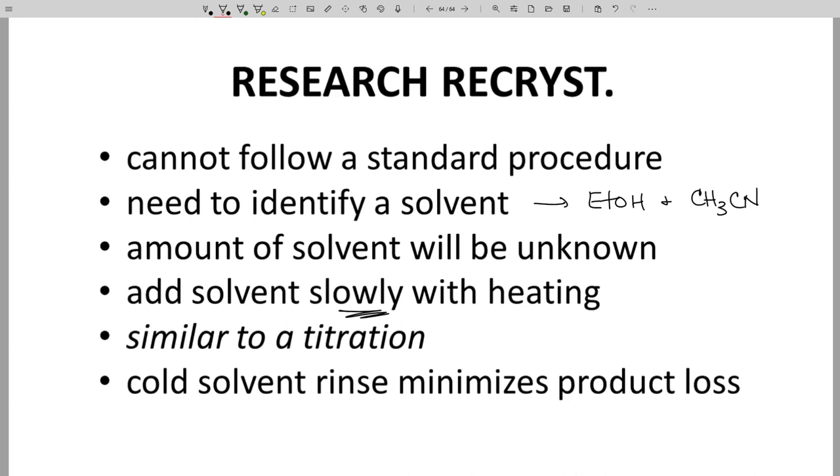That completes our quick introduction to recrystallization. Recrystallization is the method of choice for purifying many molecules, including small molecule drugs that are typically found in pills.